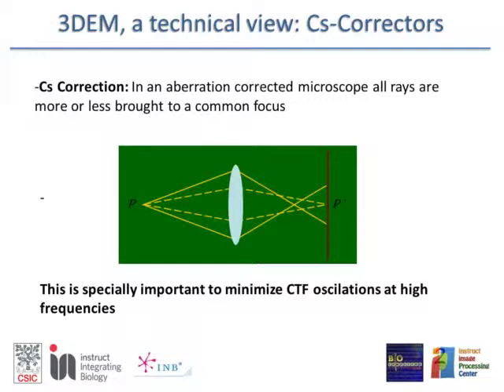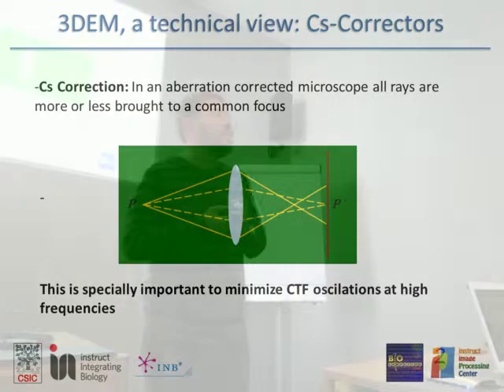Then you remember this limitation of optics. One infinitesimal point was not an infinitesimal point at the end of the optical system.